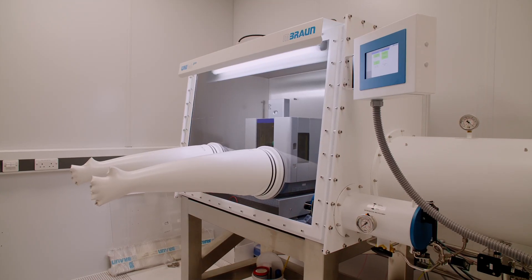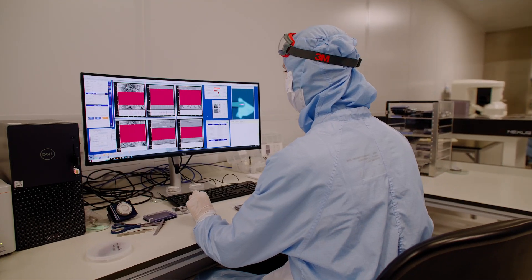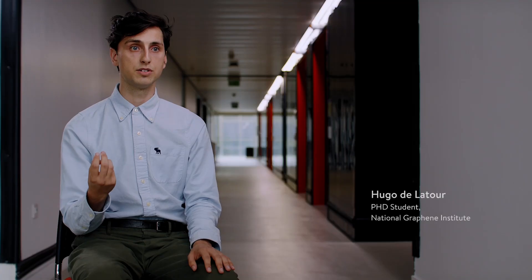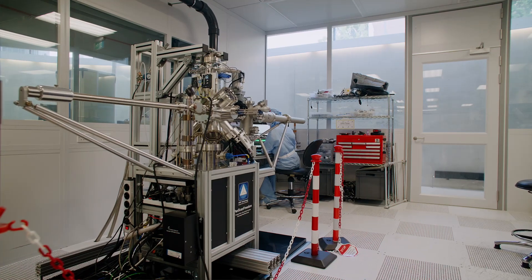Once we've created our samples in UHV, we want to characterize them to see what properties they might have. Using conductive atomic force microscopy, we've measured a tenfold improvement in the homogeneity of our stacks on the nanoscale.